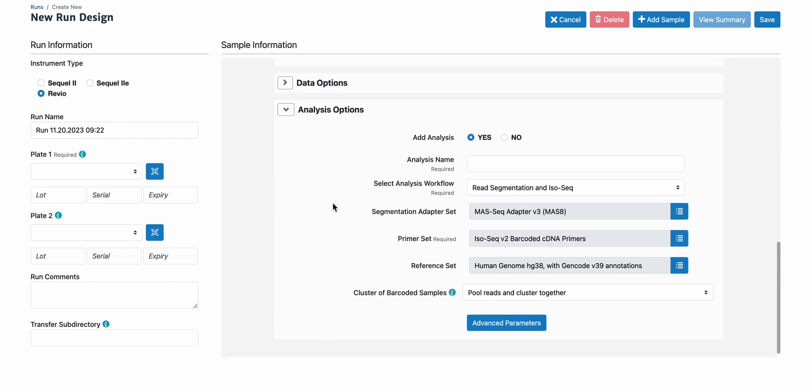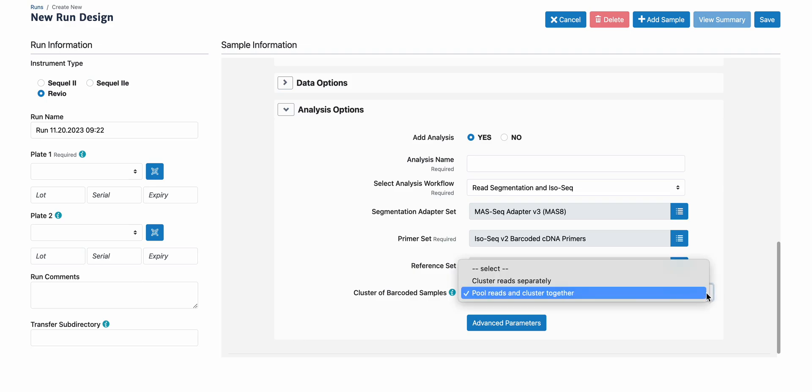For auto-analysis, the default workflow is Read Segmentation and Iso-Seq. The Kinnex full-length RNA kit uses an 8-fold concatenation, and the correct segmentation adapter set is MAS-Seq adapter V3, MAS8. The cDNA was generated using ISO-Seq Express 2.0 kit, which has the primer set name ISO-Seq V2 barcoded cDNA primers. We're showing an example here where we're using the human reference set with the Gencode annotation. I will explain in a separate video what these two options mean; for now, we'll use the default.